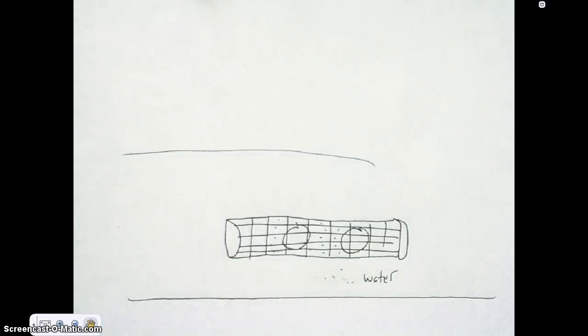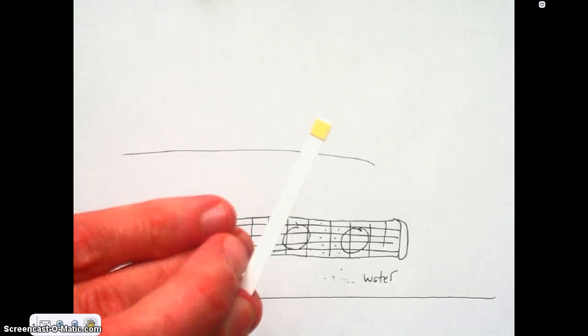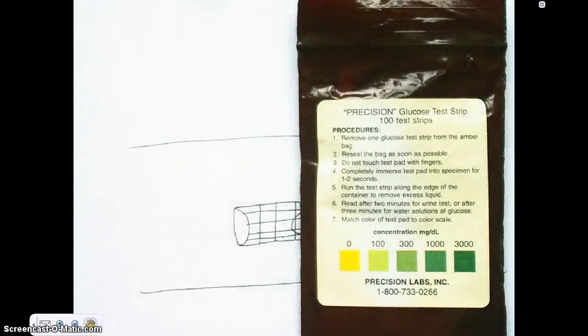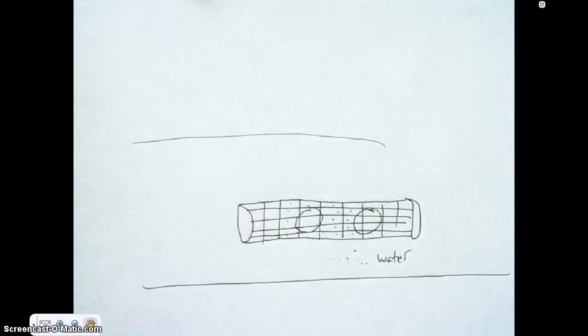I'm going to allow you to have what is called a glucose test strip. The glucose test strip looks like this right here. And you'll notice at the end it's got a little plate on it that's got a chemical on it. When it is in the presence of certain concentrations of glucose, you'll see that there is a calibration here, and by matching up what you've dipped this in, you can see how strong of a solution you have of glucose. So I'm also going to give you one of these. I'm going to give you a beaker and water, and of course everybody knows what a beaker looks like with water in it. And so these are the materials you're going to have.